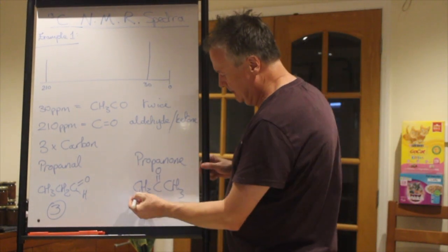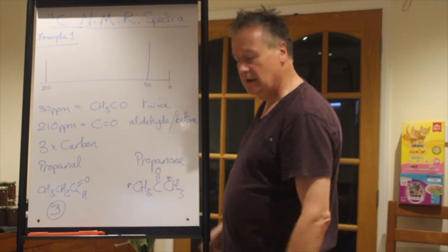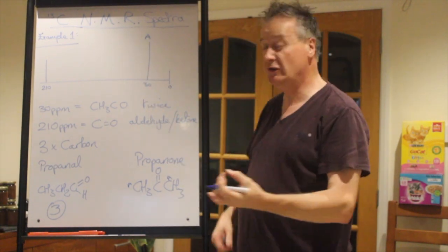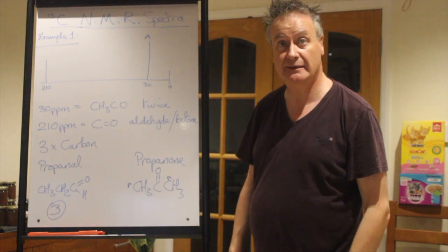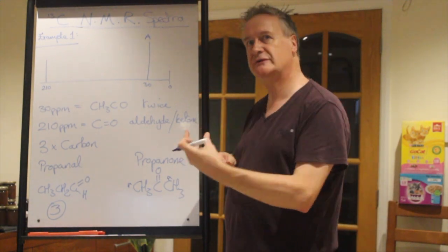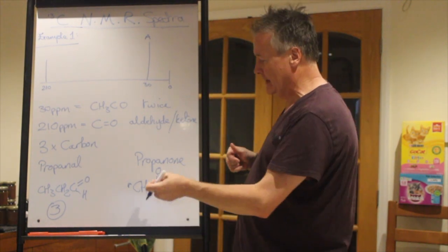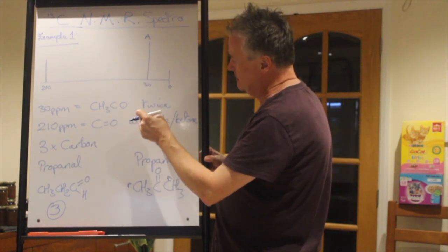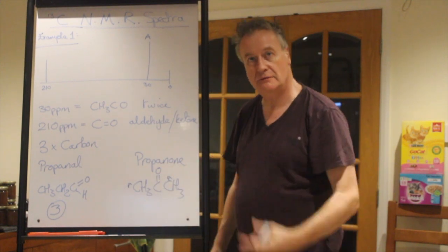Why is it this one? Because that and that are carbon A, which represent that. And I strongly advise you to do this lettering and linking it to the peaks that you also label with the same letter and reference in your answer, because the way you have to do it, you have to write your thought processes down. So you would say A represents this, and there are 2 of them, and here they are in the molecule.